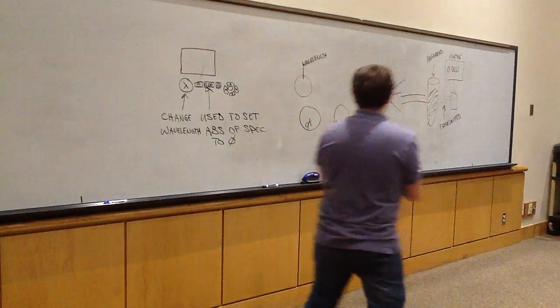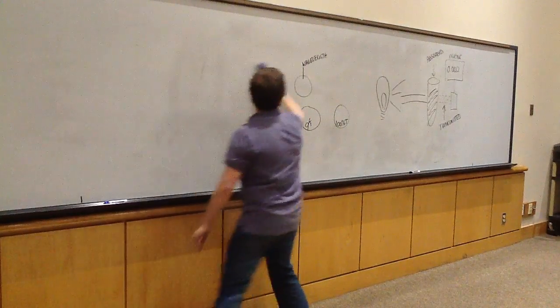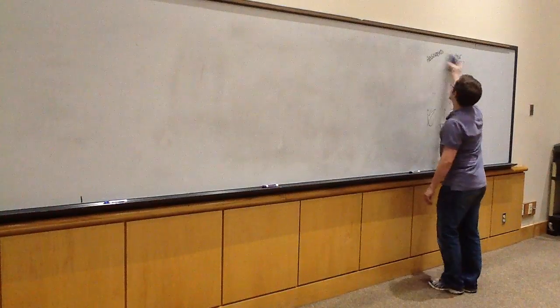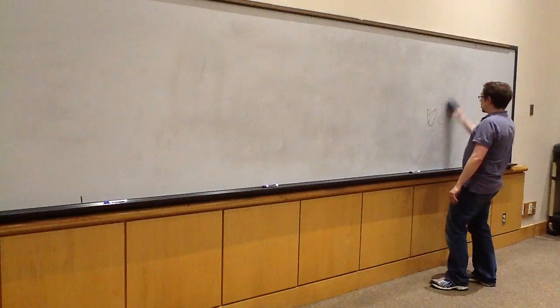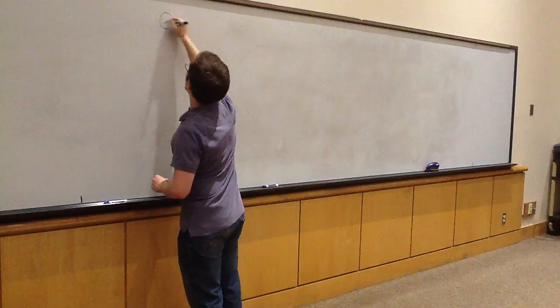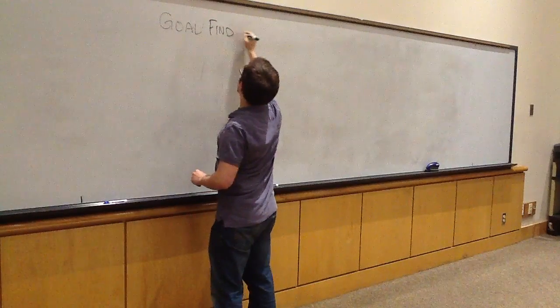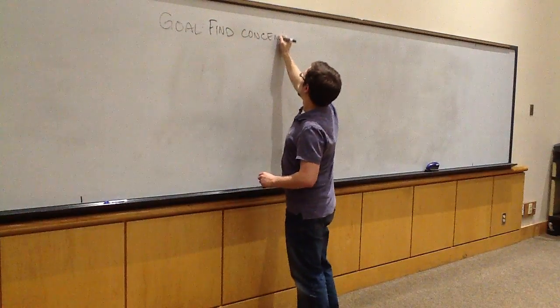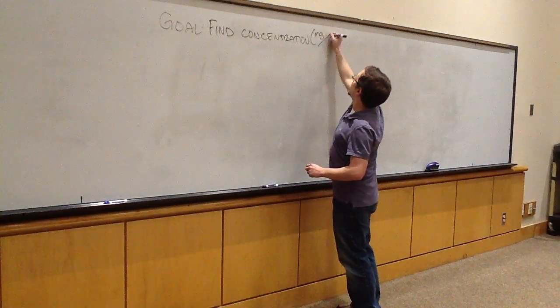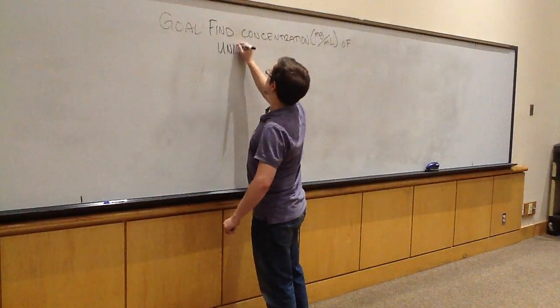Awesome. Okay. So let's go ahead and talk about the overall goal that we had for this exercise. So your goal for spectrophotometry was that you had an unknown protein solution. So our goal was to find the concentration in milligrams per milliliter of an unknown protein solution.